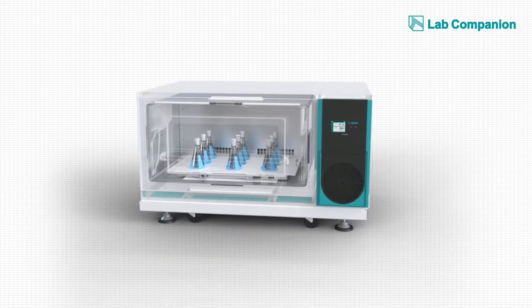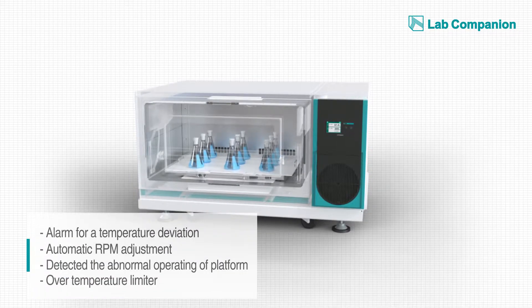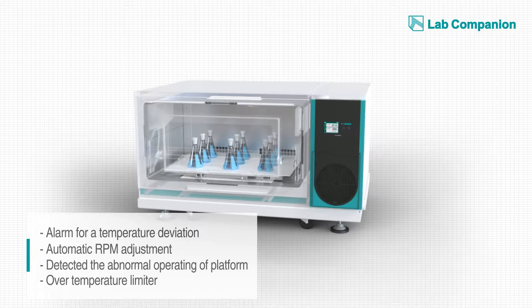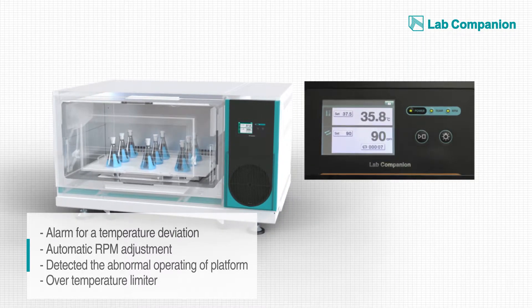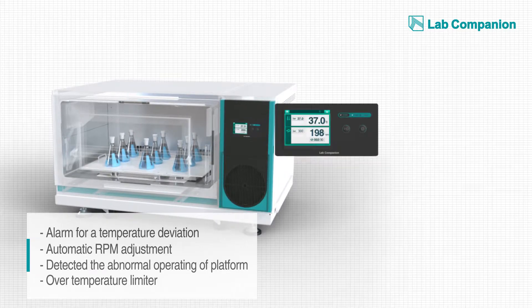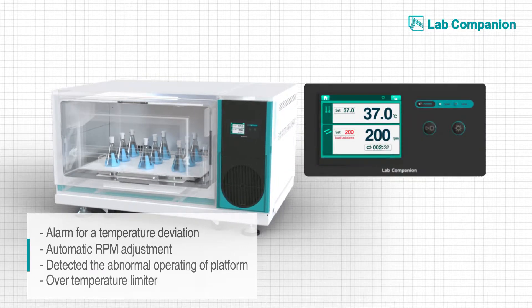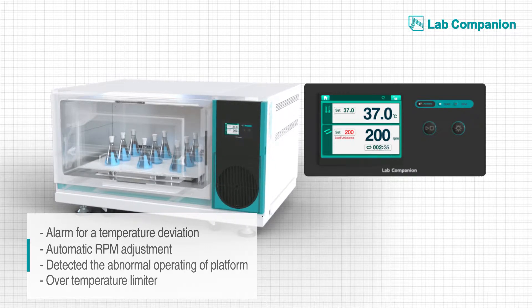The control unit includes a self-diagnosis system that was designed to protect the experiment and safety from any risks. When the chamber temperature deviates too far from the set level, it sounds a cautionary alarm. When the sample load is higher than the specifications, or when the load balance is not right, the control unit lowers the RPM speed automatically.